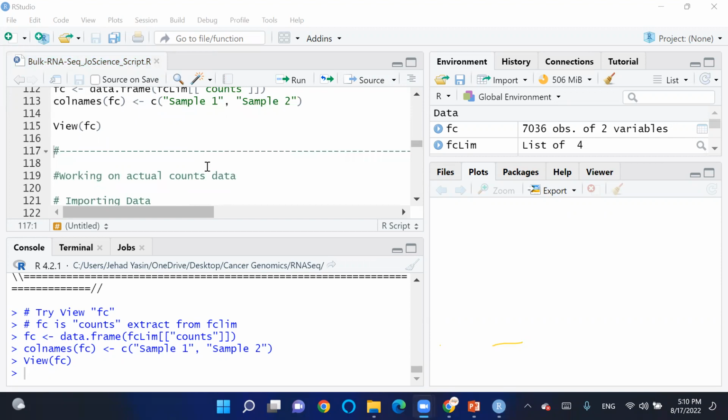Here there is a question: why did you choose only the exon feature? What is the objective behind it? Basically, in our analysis, we are just focusing on regions within the DNA that are coding for protein production. So we are focusing just on exons. We are not analyzing non-coding regions of the DNA. We are not analyzing introns. We are just focusing on exons. So this is the main goal behind choosing the exon feature.